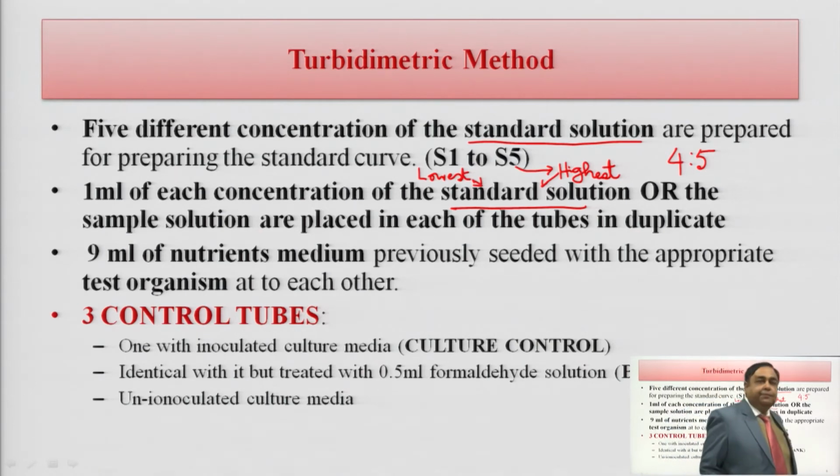And these solutions, in a quantity of 1 ml, are to be added in sterilized test tubes in duplicate.